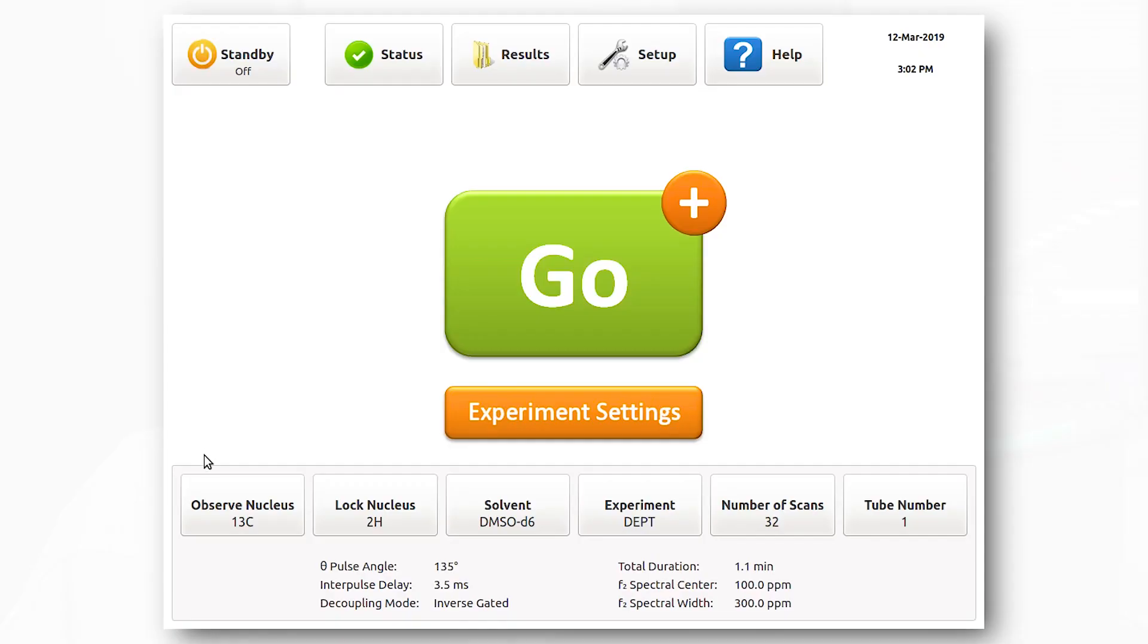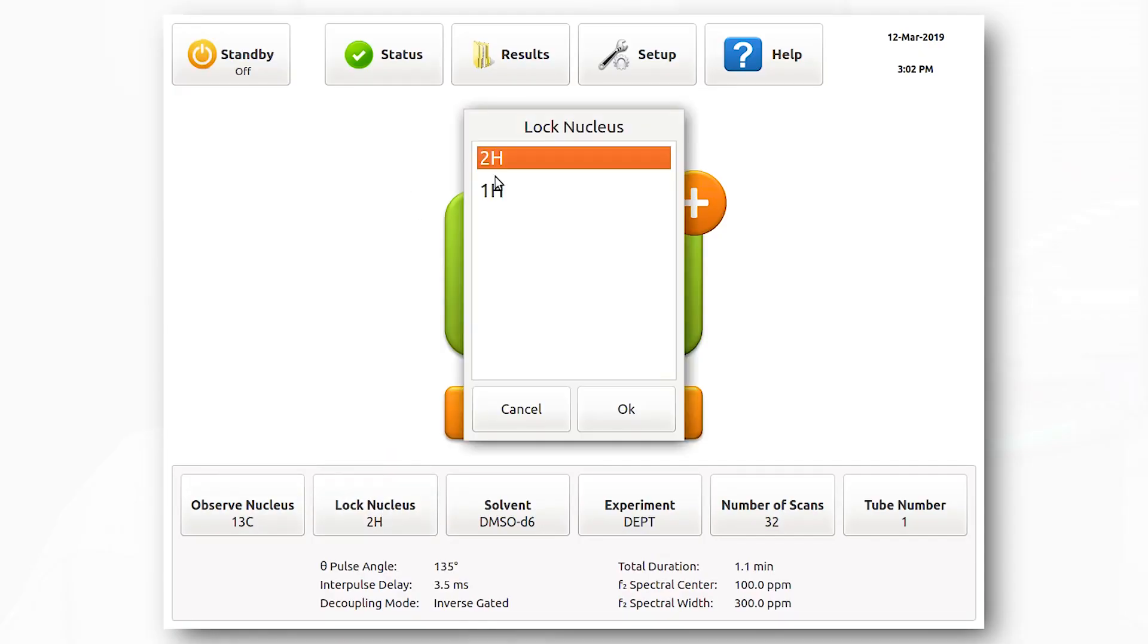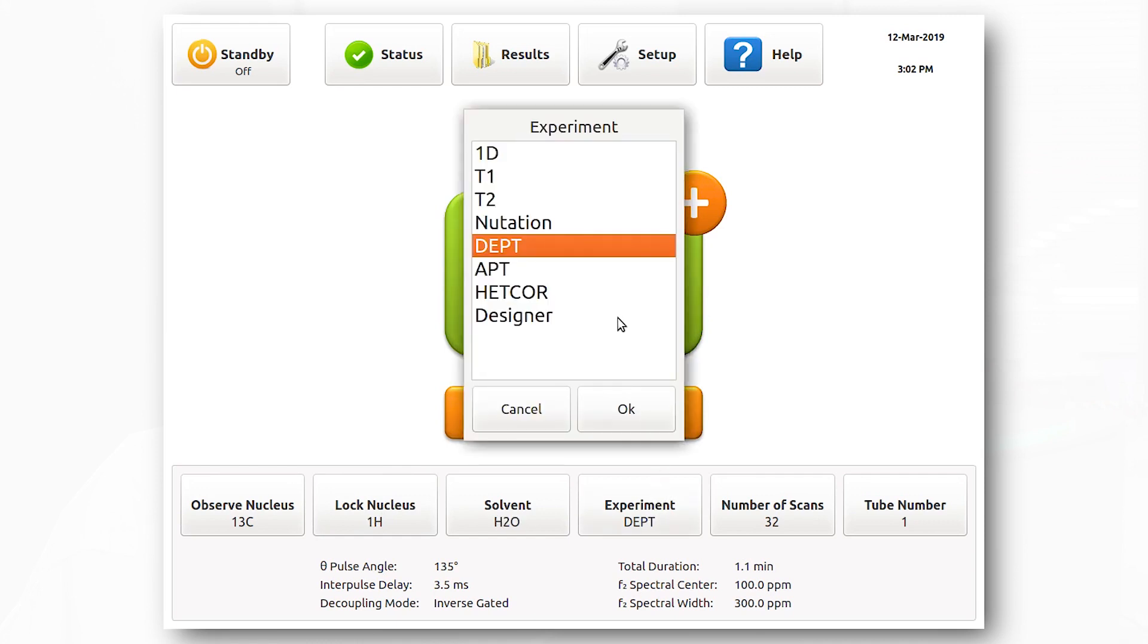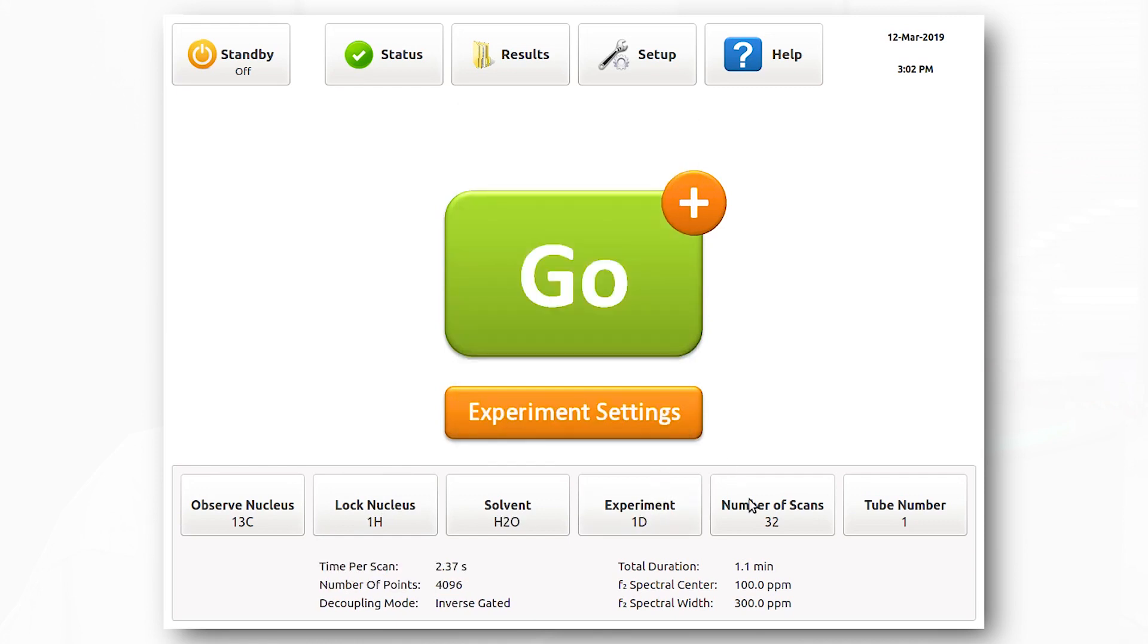Our spectrometer can also run samples NEAT or with proteo solvents. For this carbon experiment, we will use a NEAT sample of DEP. The parameters are all the same, except the lock nucleus needs to be changed to proteo, experiment needs to be changed to 1D, and the number of scans need to be increased to 32.